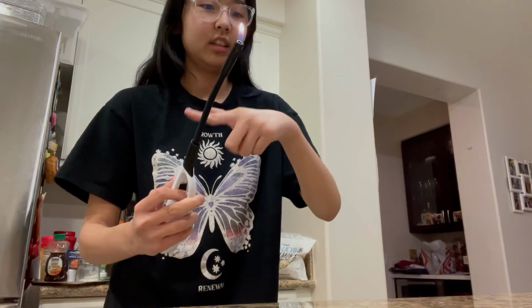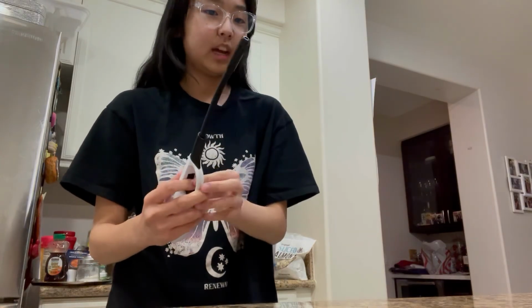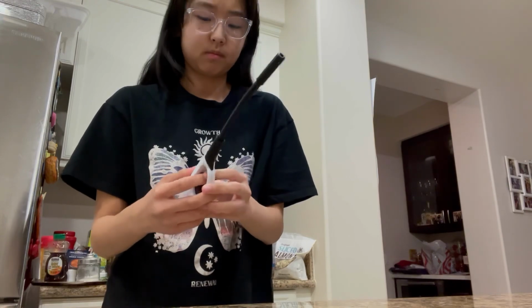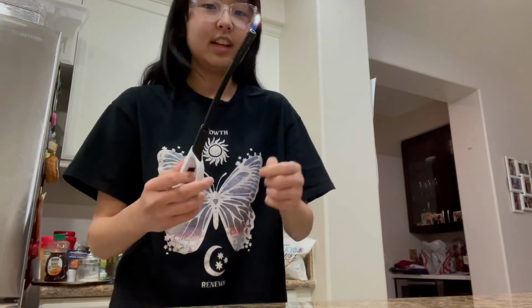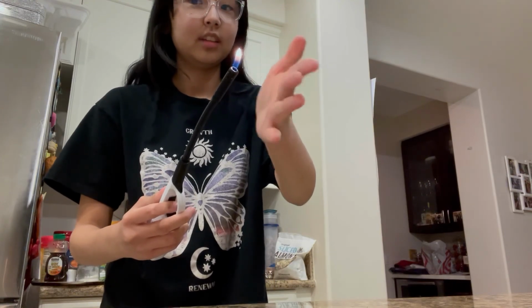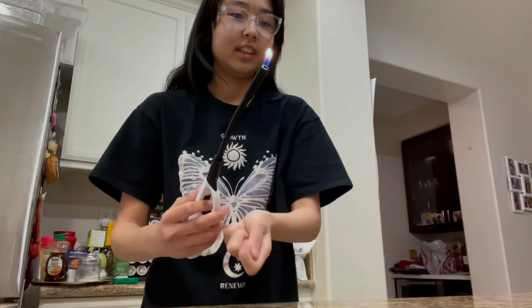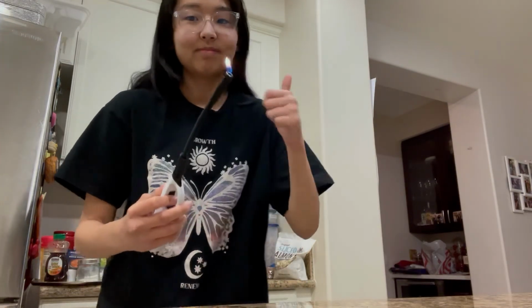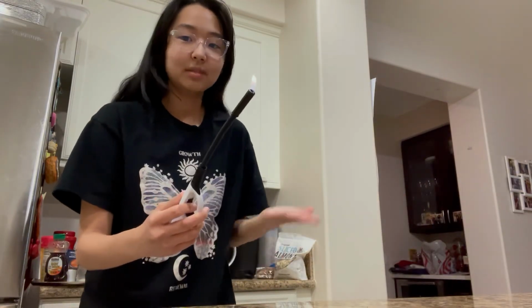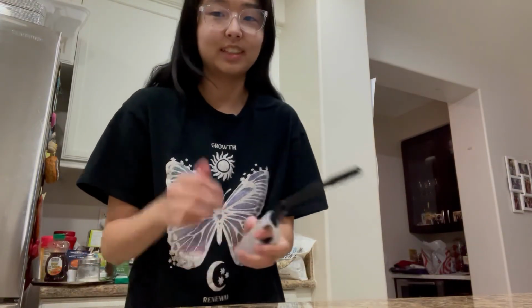That is, energy is being pushed out and creating fire. And if I hold my hand kind of close, it's warm around it. The surroundings are heating up because of the fire that is nearby. And that is a very simple example of an exothermic reaction.